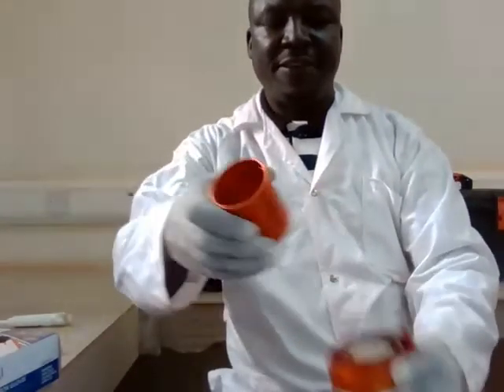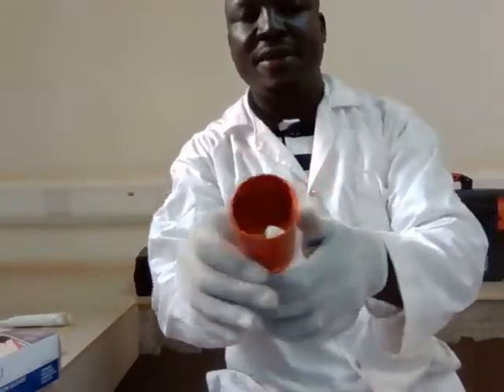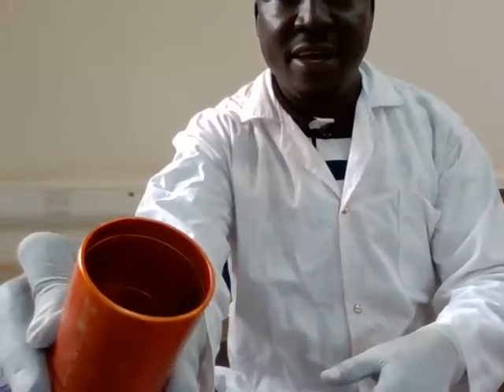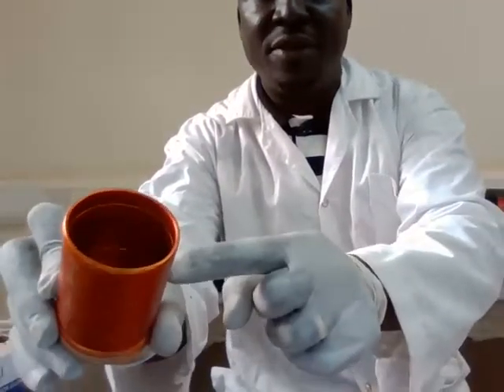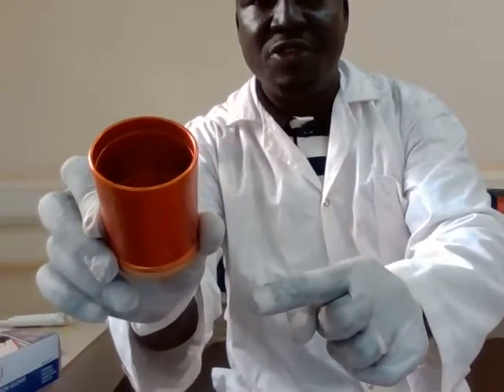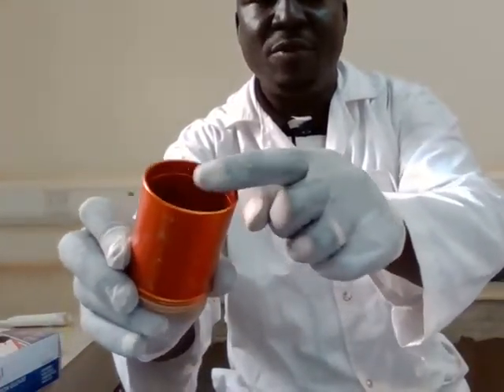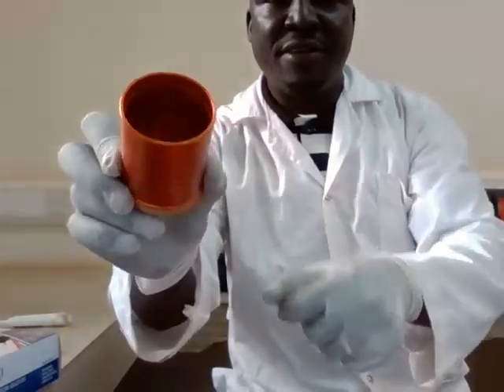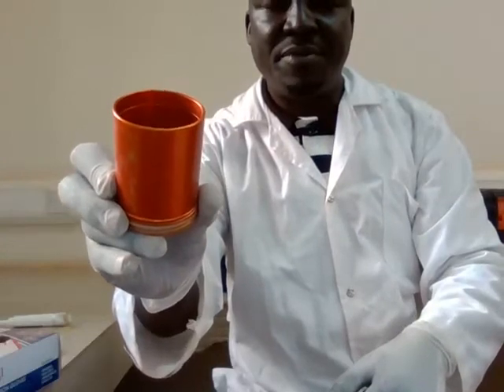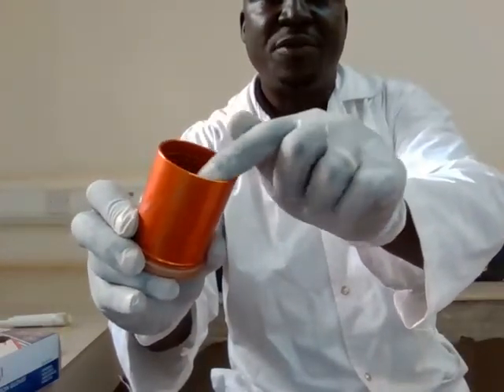As this starts, realize that inside here, there is that lower area where you see that ring, which shows the volume, and then on top here is another volume. The first ring in the middle that you see there is for 50 milliliters of water sample we're testing.